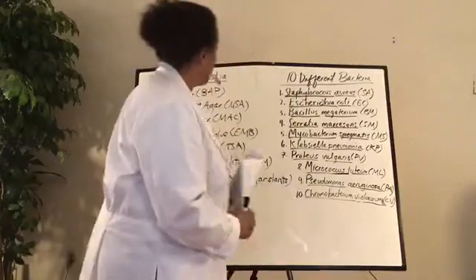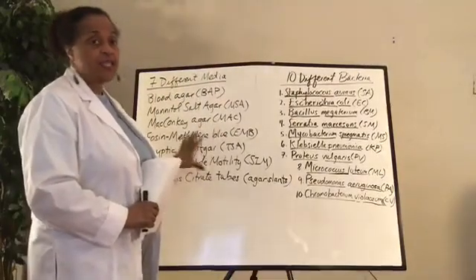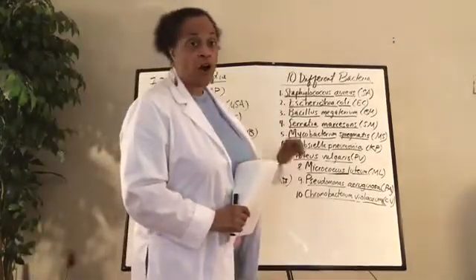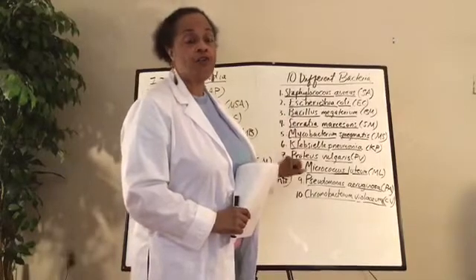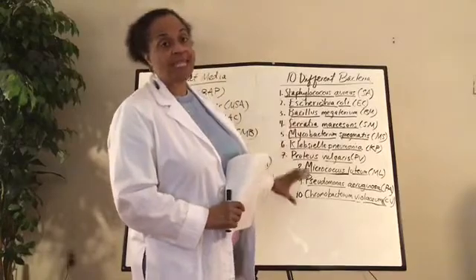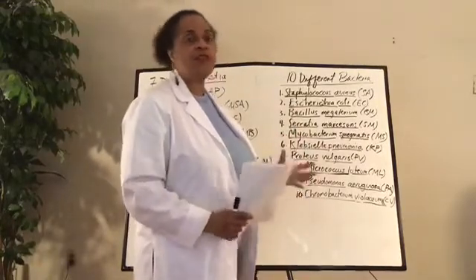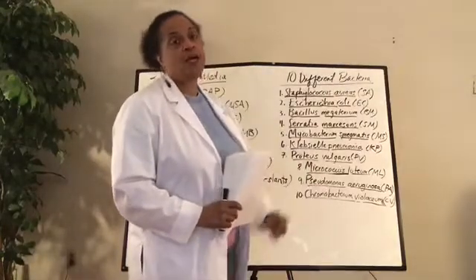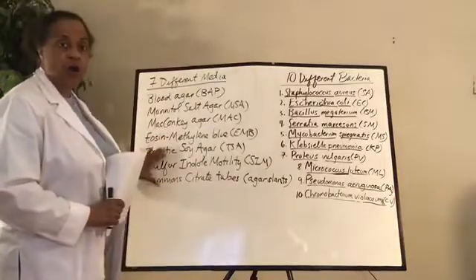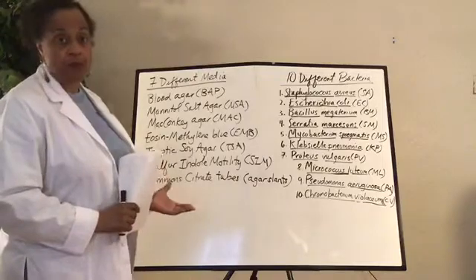So behind me here we have the 7 media that we're going to be using to inoculate. And then we have these 10 bacteria. All of these bacteria are on your syllabus in the lab syllabus. So if you need to spell anything, I spelled them all out here. But if you have some problem with it, they're all written throughout your lab syllabus. Here, we've used all of these media before at one time, so you're familiar with them.